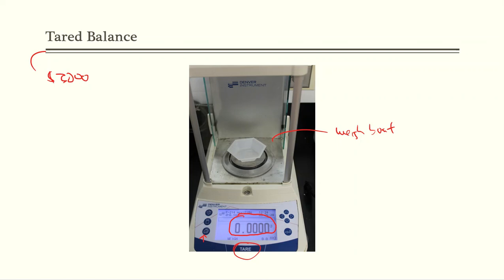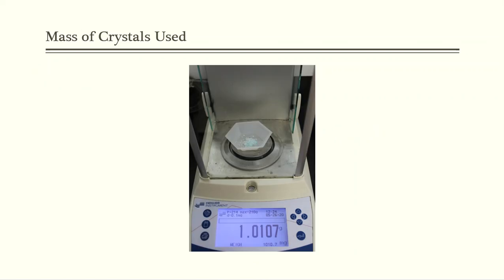Now the reason I did this is because I'm getting ready to add unknown to my weigh boat, and that way it will save me a subtraction. I don't really have to deal with any kind of math, because if I can get this to read zero and then add my solid inside, that will give me a direct readout of the mass that I have added to that weigh boat. So the laboratory procedure is going to tell you to weigh out about 1 gram of material. So here is the mass that we have massed together.